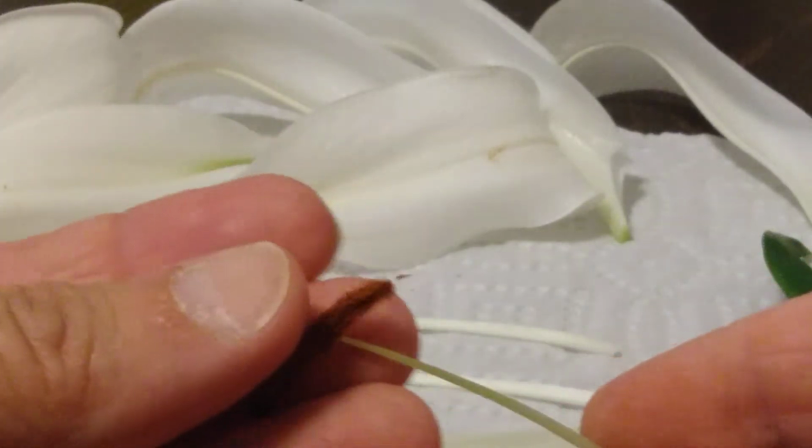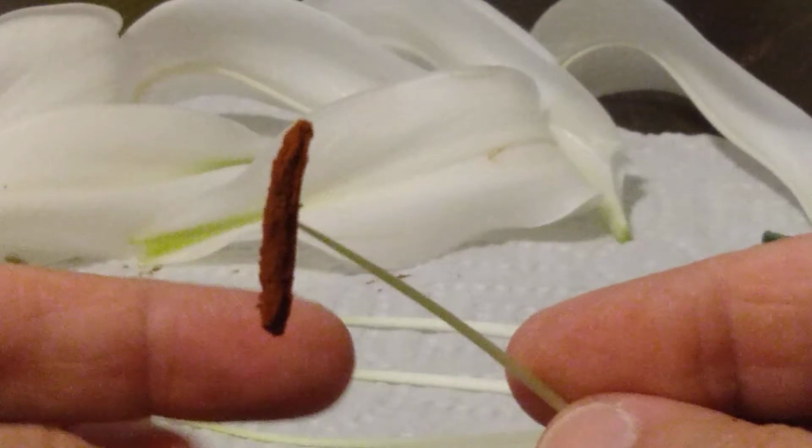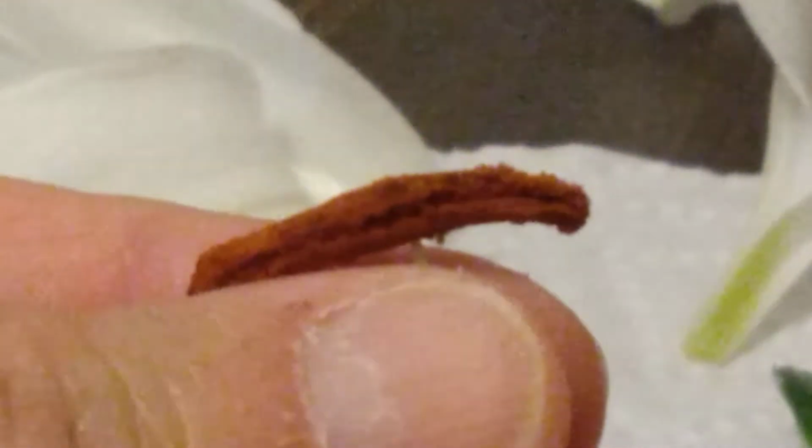So this is already a mature anther. It dehisced, it opened, and the pollen is coming out. Let's see if we can get a closer look at that. Second focus. All right, so if you can make out pollen grains on there, this is the anther. And let's see if we cut it open.